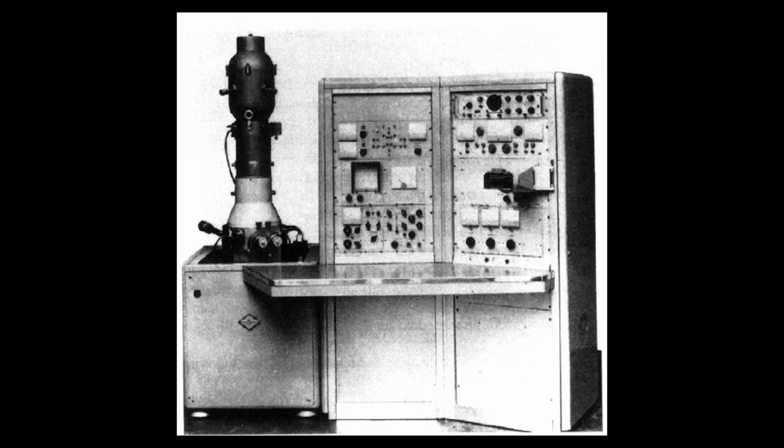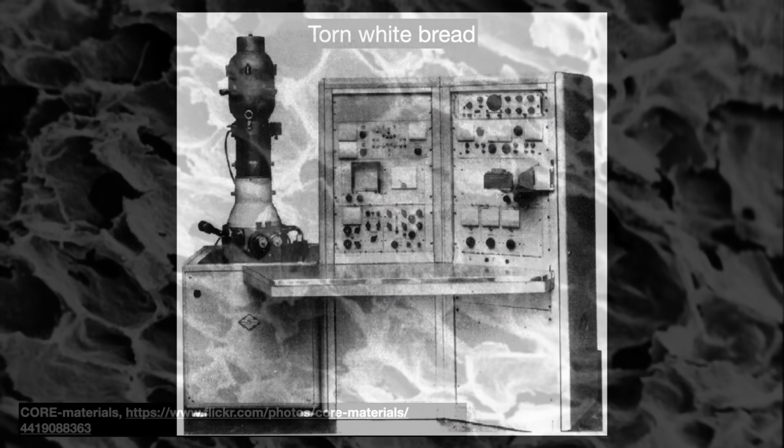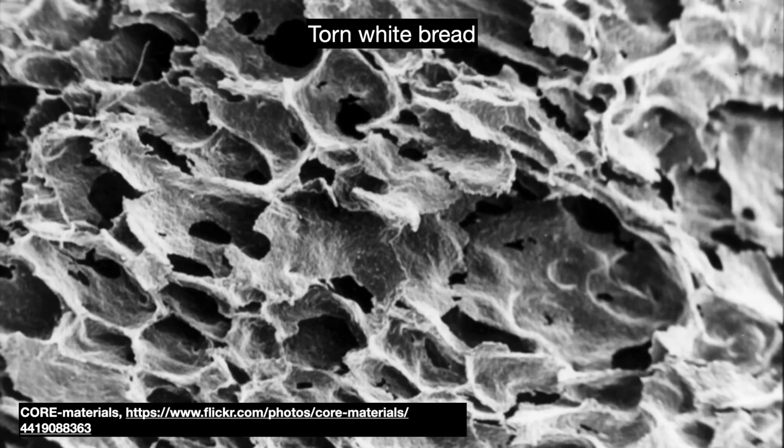It was a device that virtually nobody believed in. The Scanning Electron Microscope, or SEM, is famous for its amazing three-dimensional photographs. It is hard to imagine a world without such a machine, not only for eliciting the curiosities of children and nerds like me, but also for diagnosing semiconductor issues.